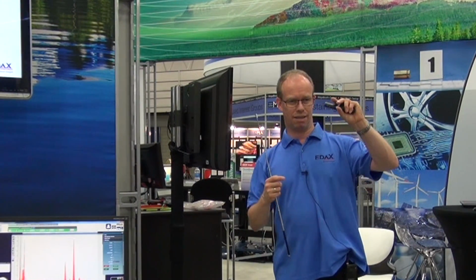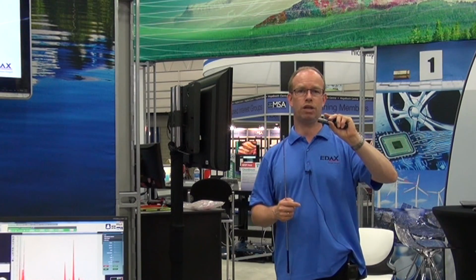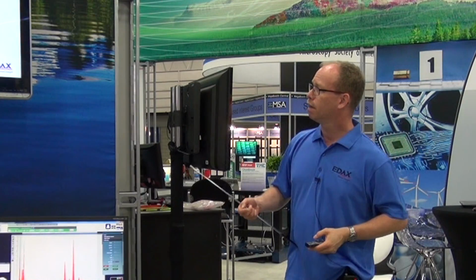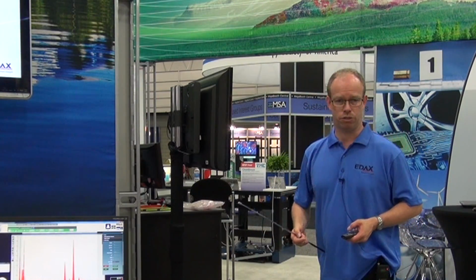That means that it needs to be a little bit thinner than you would normally use for TEM, or you can just see the area really close to the hole, to the edge of the sample. You need a dedicated sample holder, as I just mentioned, and you need patience.